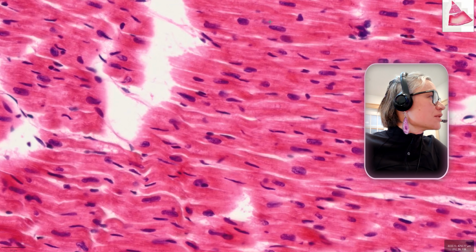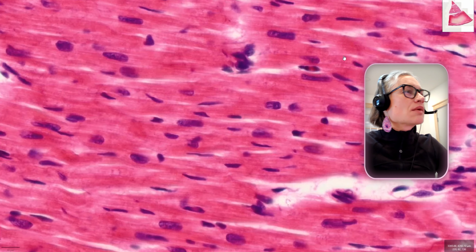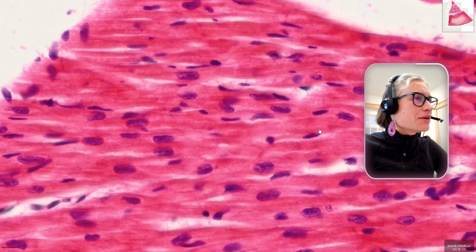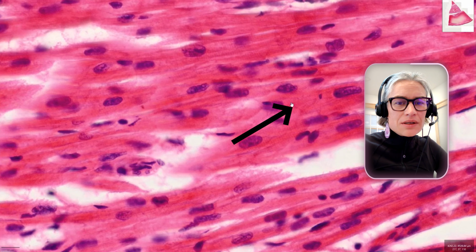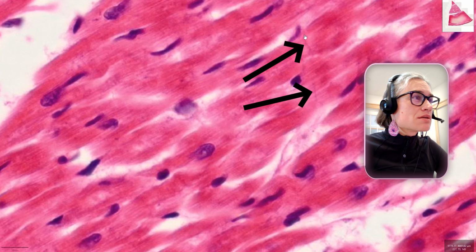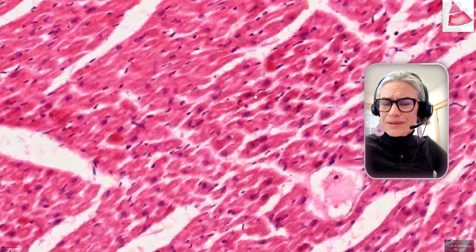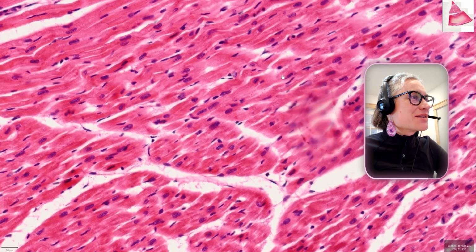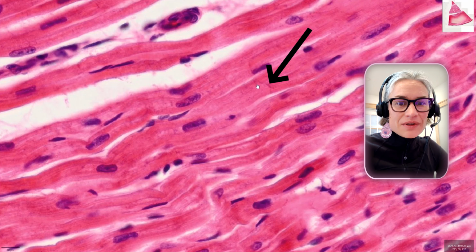They're basically supposed to be a little bit of a jagged line like that. So let me look for some more. I would say this is probably one. Not spectacular. I would like to see them better. Maybe this one here. Oh, maybe this and this, or it can also be an artifact. There's always this question, is it real in the slides? And sometimes it's difficult to distinguish what is artifact and what is real. Oh, but I think these are real. Look, this one is pretty real.